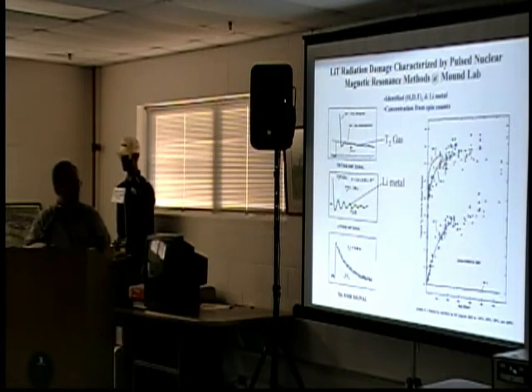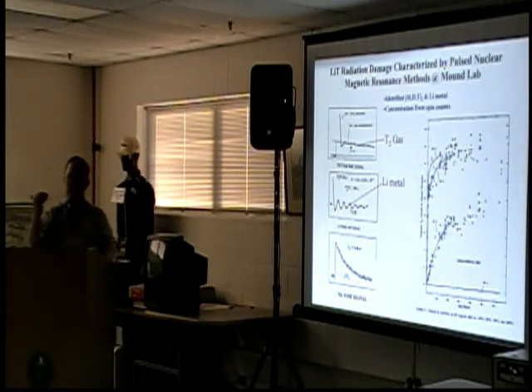This is lithium-7, and this is the lithium cations in the solid, and the bumps are from lithium metal. The difference between a metal and a salt is a difference in the frequency, and there's a beating here, so this is the lithium metal. And we could tune our resonance frequency and measure the amplitude of that.